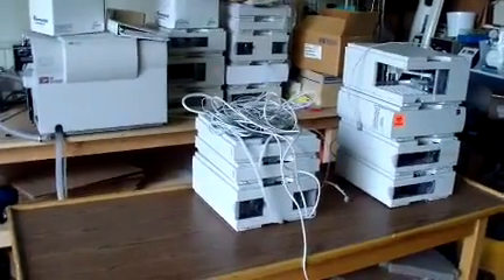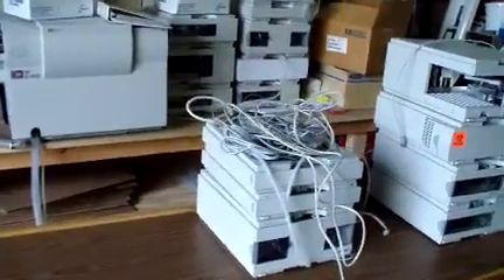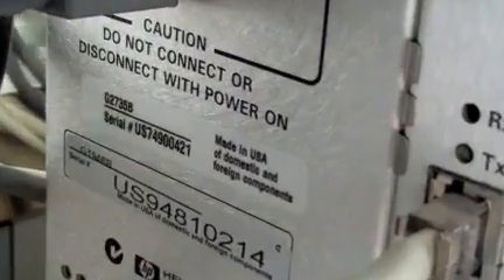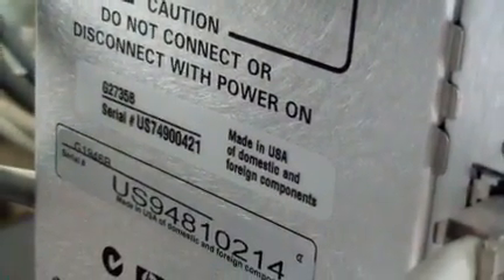Keith from DCSP Medical. We're looking at the HPLC MSD system and the components for it. I have at least one manual, and I have a ton of just pieces and parts to go with it.